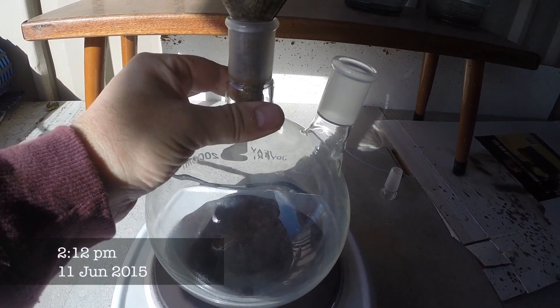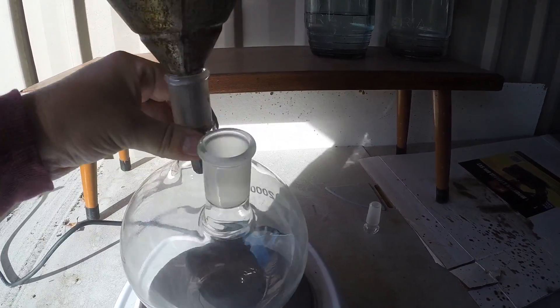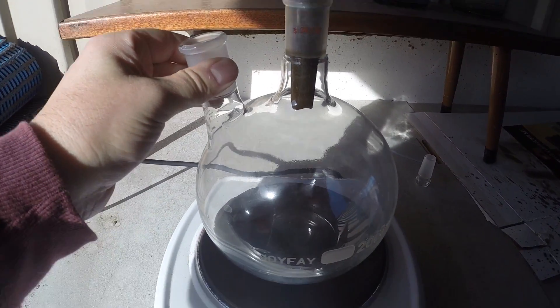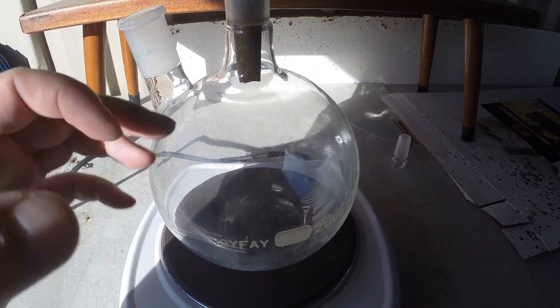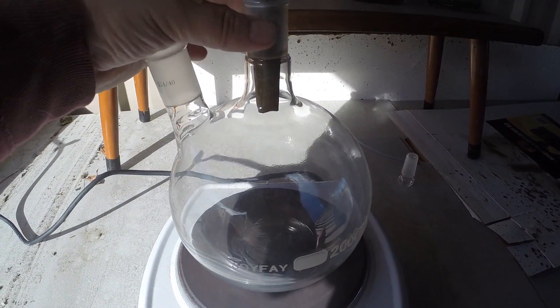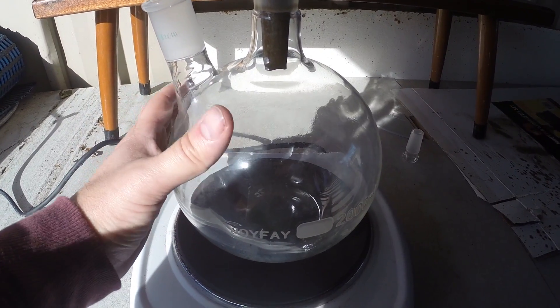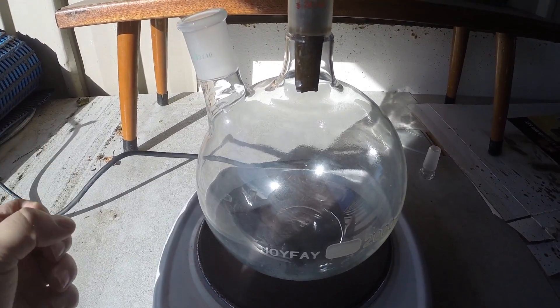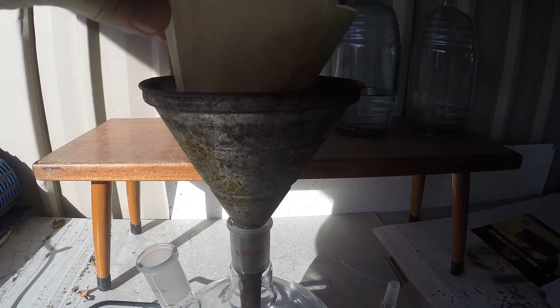We've got our lab glassware — the special glass, or borosilicate — it's very very good with heat. It's not ideal; we'd be better off with just a big beaker, but we don't have one so we've got to make do with what we've got. You don't really want to use normal glass because that has a tendency with heat differences to just shatter and explode, and you don't want the acid to go everywhere.